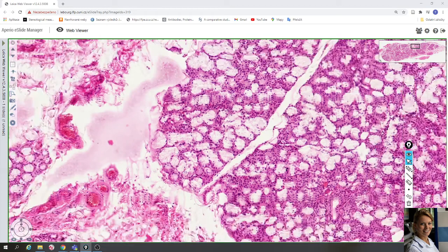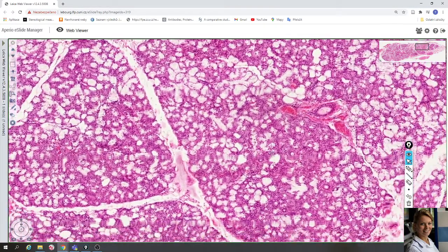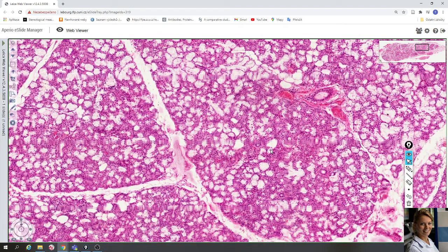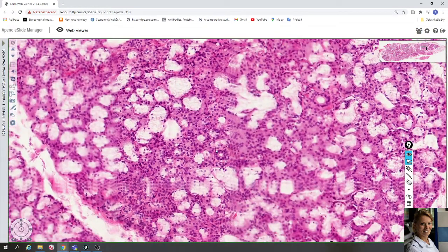In the lobules you can find intercalated ducts, but in the sublingual gland the intercalated ducts are short or absent. Very often you can see non-striated intralobular excretory ducts, which are more prevalent and are lined with one layer of cuboidal cells.